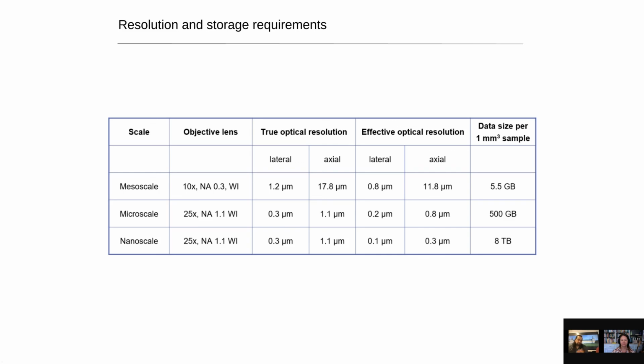So I think the advantage of the light-sheet system that we show, the place where you can change objective, plus the fact that you have the entire neuronal circuit contained in your sample, is the one that actually allows you to get all the necessary information, but in a, let's say, smarter way.